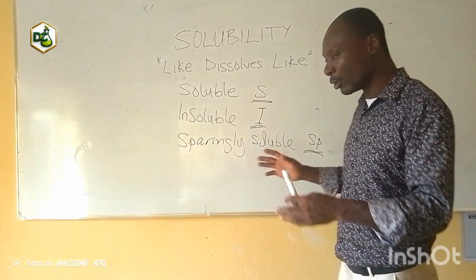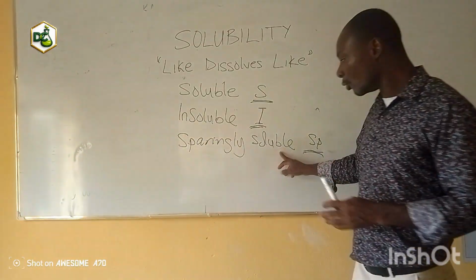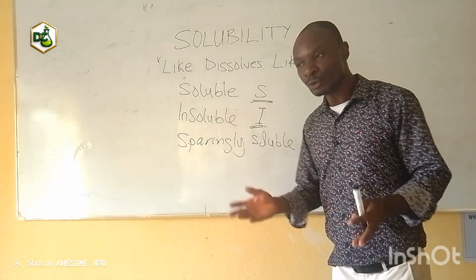And alcohol is mixed and it forms a cloudy solution, that is sparingly soluble. I will present it with SP. That's what you are expected to do.